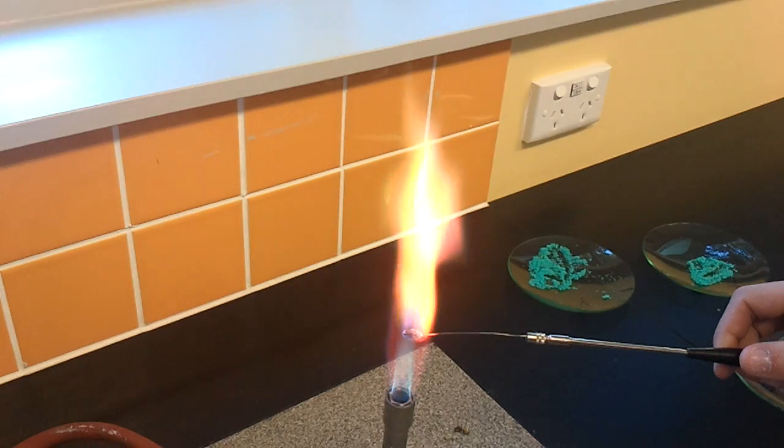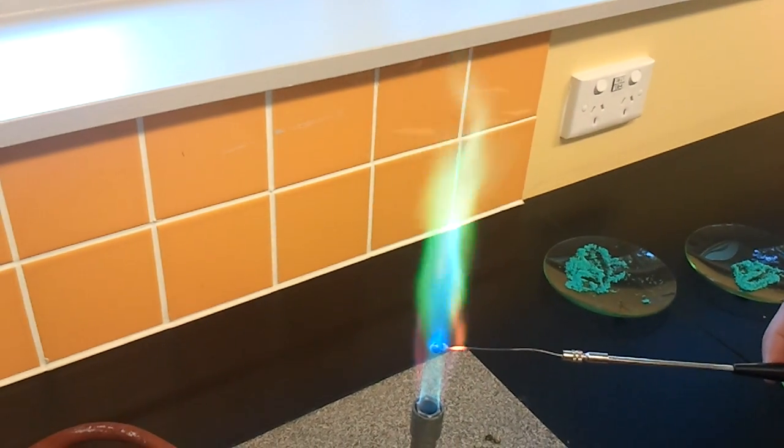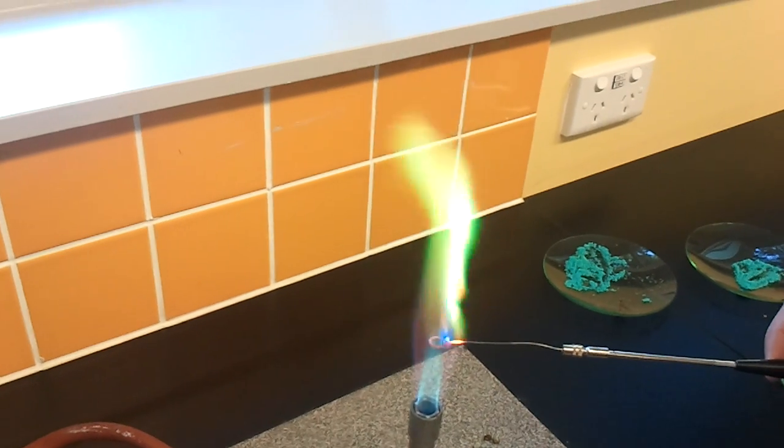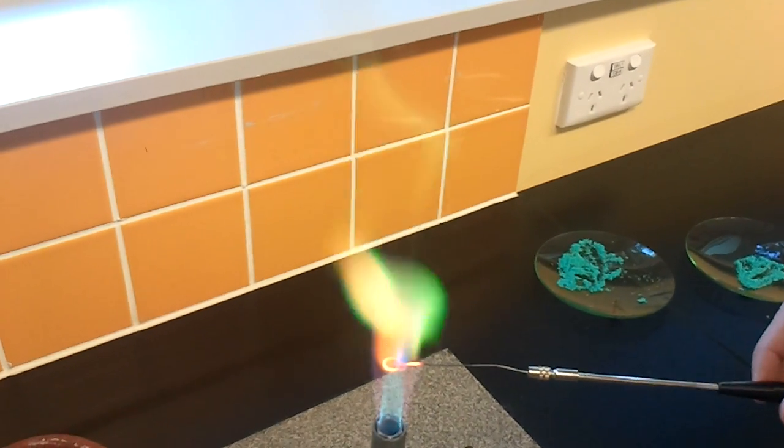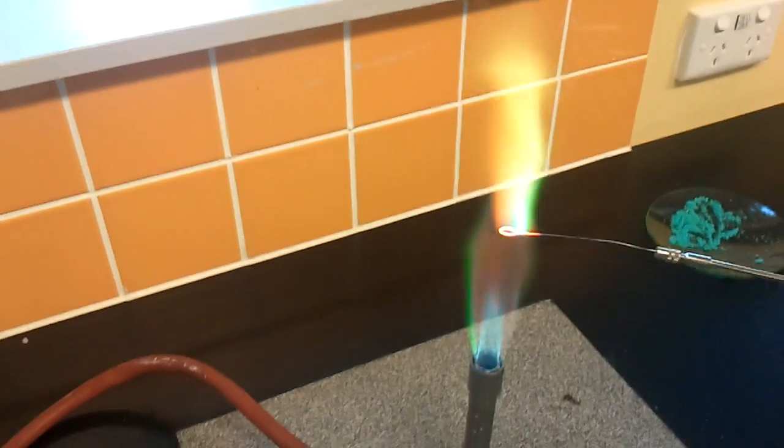It doesn't pick up the... it doesn't pick up most of the color. Bad camera. Because you know how it's full, like, this purpley red?